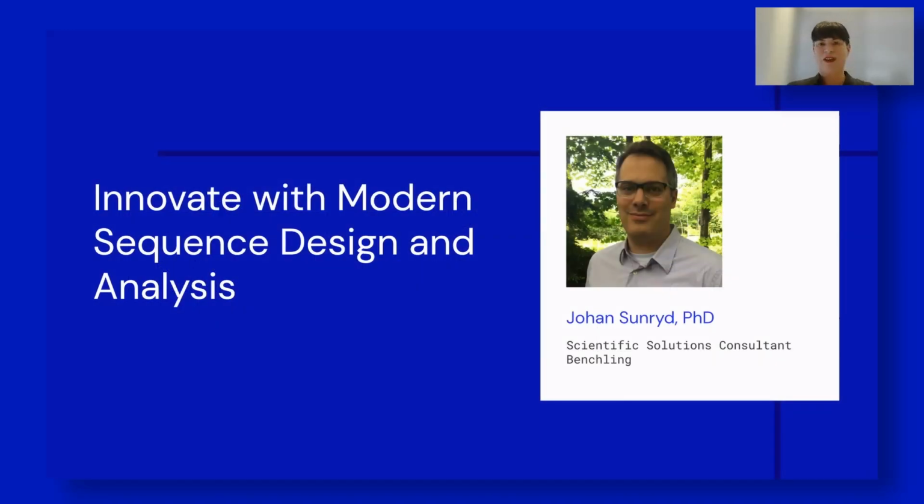Thanks, Zach. That was a great presentation. For our attendees, if you have any questions about the new RNA capabilities in Benchling, feel free to enter them in the Q&A chat and we'll do our best to answer them. These new features to look at RNA are really exciting given the recent trends in developing RNA therapeutics. We've also been working on some new sequence design and analysis tools that can be carried out in bulk to improve the throughput and predictions. And Johan is here today, another scientific solutions consultant, and he's going to share an update with us.